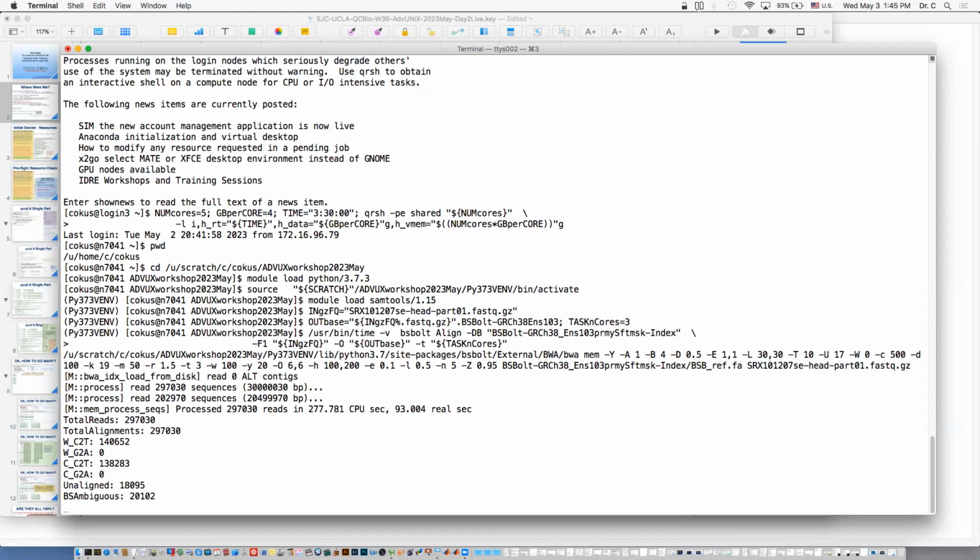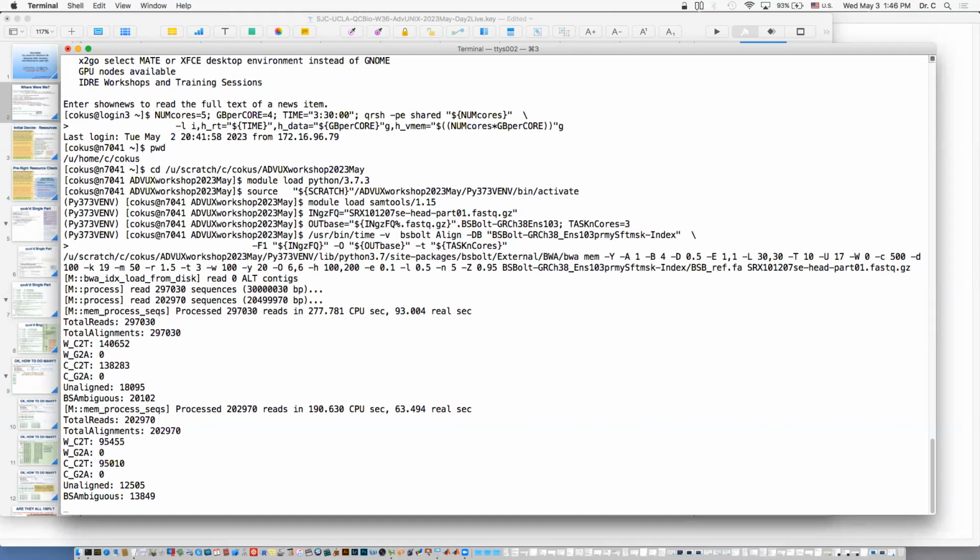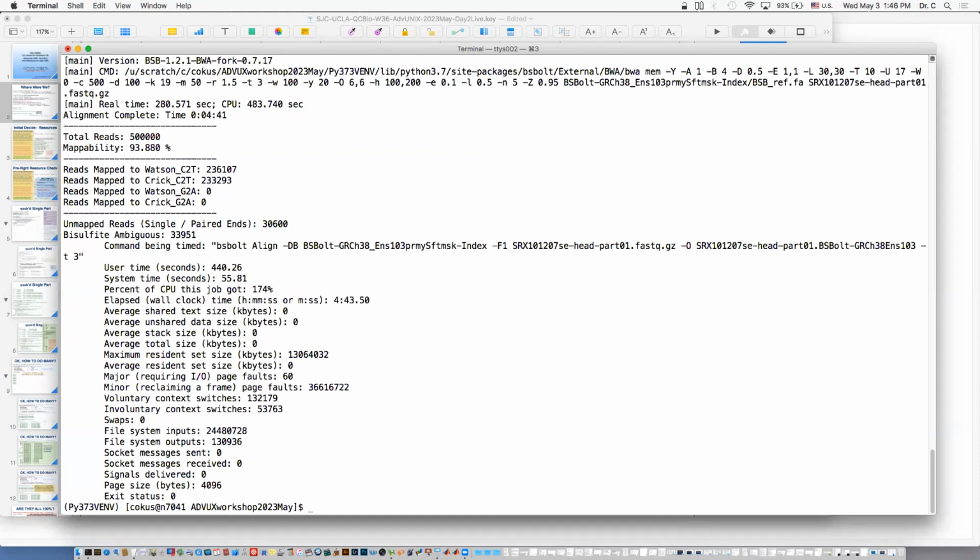So we run the test run within time, which is going to produce the stats soon. Yeah, maybe there's 2 passes for the alignment here. I don't know why time hasn't given us the output yet, unless there's 2 phases in the aligner. Maybe that was phase 1. Yeah, it looks like there's a phase 2. We have to do some more alignments. So I guess that pause there was probably that. All right, so anyway, there's 2 rounds or something. We'd have to really dig into the source code to figure out exactly what the logic is, but we're just guessing here.